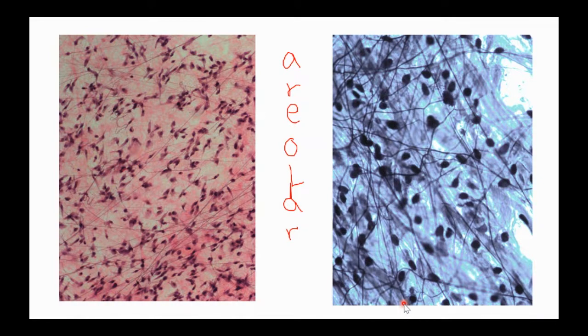Everything's not completely filled up with proteins or with cells. That's areolar loose connective tissue. So, two different colors for us to practice identifying. Sometimes the way we stain it, it looks blue, like I see over here. Sometimes it looks pink and purple, or pink and blackish. My two types of areolar connective tissue.